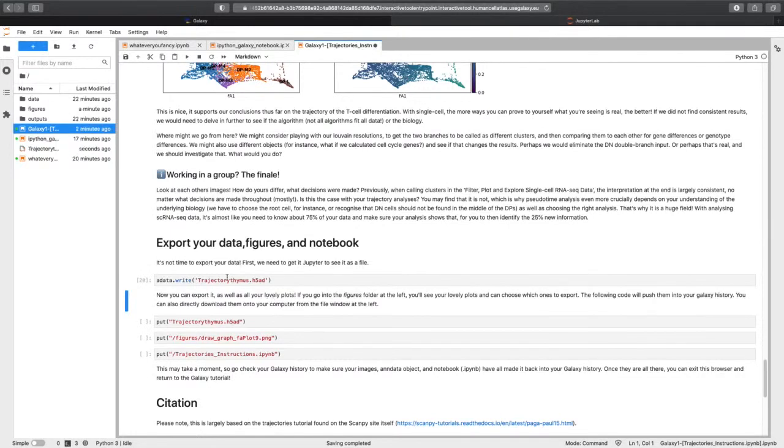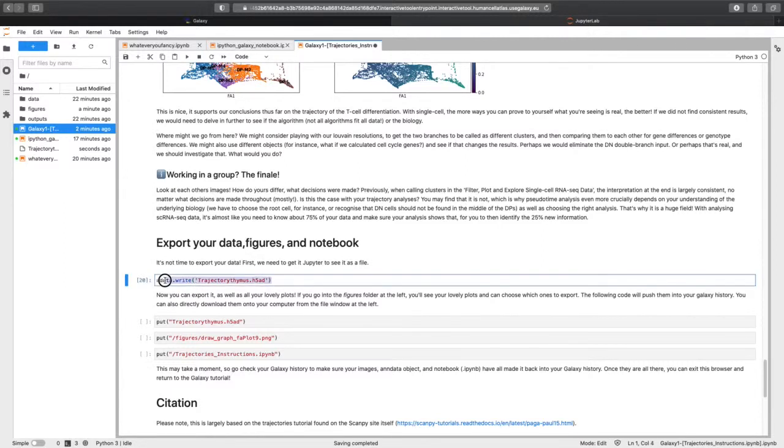That is very annoying. In the original of this, it has quote marks here as opposed to one apostrophe. So don't let that get you.